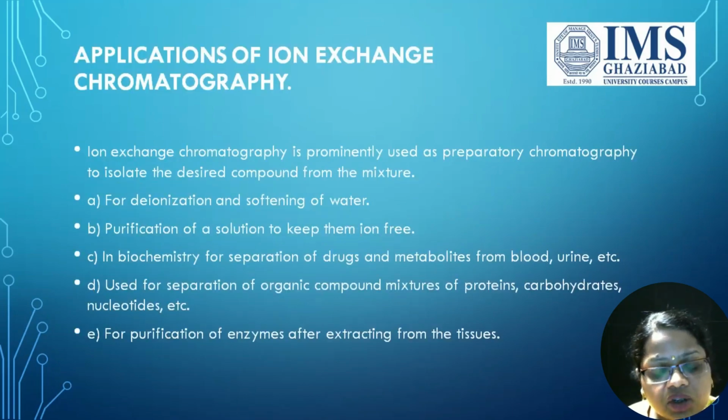Coming to the applications of ion exchange chromatography, this technique is used for deionization and softening of water, for the purification of solutions to keep them ion free, in biochemistry for separation of drugs and metabolites from blood or urine, for separation of organic compounds, mixtures of proteins, carbohydrates and nucleotides, and for purification of enzymes after extracting them from tissues. So this was all about ion exchange chromatography.